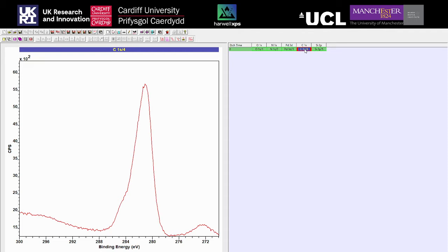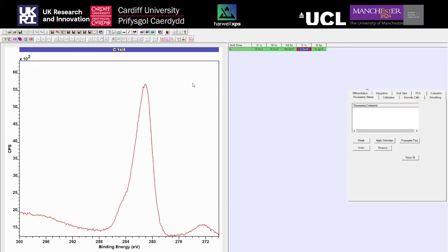Carbon generally tends to appear on everything as an overlayer - it absorbs from the atmosphere, which is one of the reasons it makes such a good reference point for insulating materials. It's also one of the reasons it's a controversial pick, since the exact speciation of these carbons isn't perfectly known and there can be some shifts in these carbon overlayers. However, it does remain the principal choice for calibration.